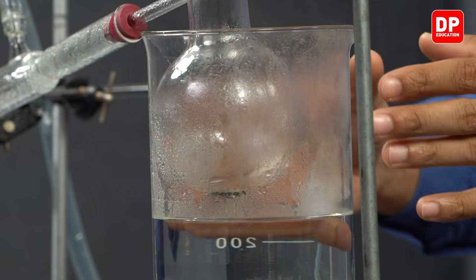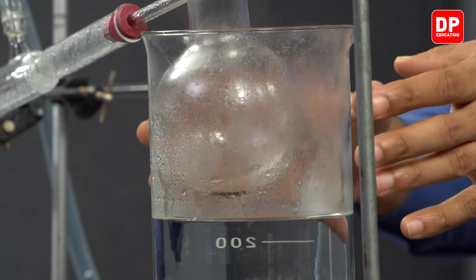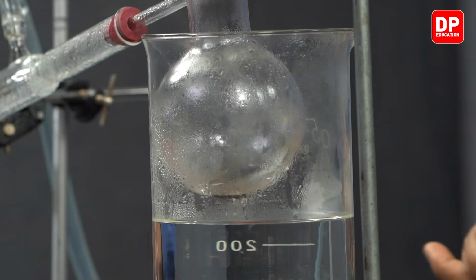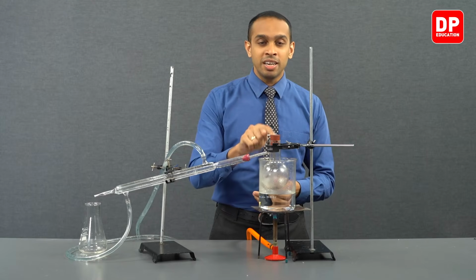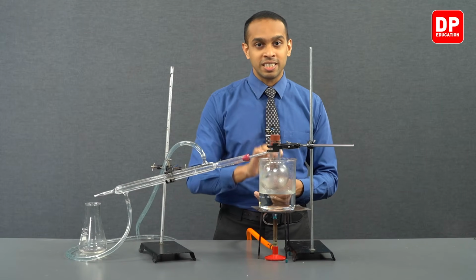So what we see here is eugenol that is remaining on our distilling flask. So to see it very clearly, let's remove this steam bath from this setup, and we'll come back to observe the essential oil that is remaining in our distillation flask.